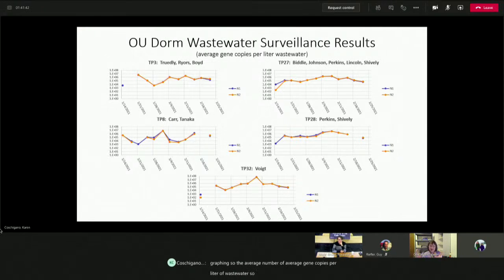So I have to do a lot of calculations, but I'm assaying two viral genes. Well, this one gene, the N gene, but in two different places, N1 and N2. And as you can tell, they're lying pretty much right on top of each other. That was really good for me. It showed me that they're kind of a control for each other. If I see a signal in one, I'm seeing a signal with the other one as well. So that lets me know things are working well.